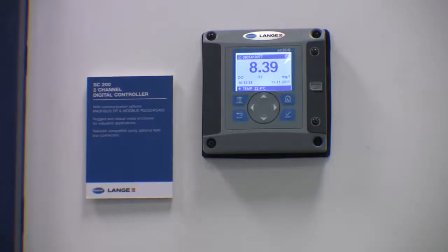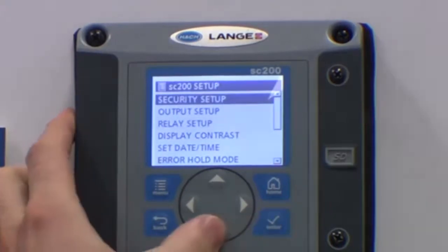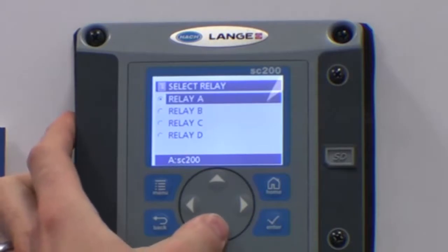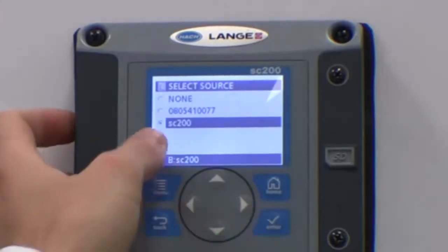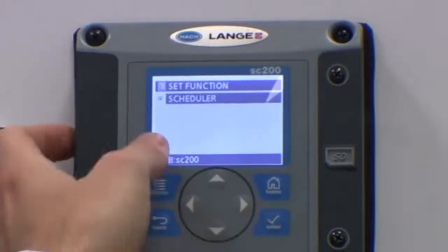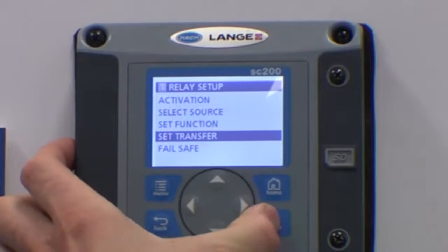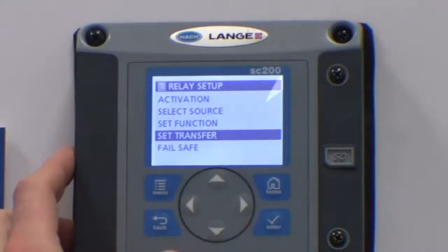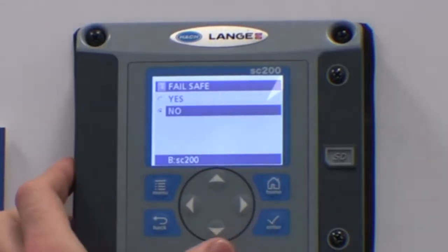Here is how to set up the cleaning cycle. Press the menu button and select SC200 setup. Now select relay setup. Select the relay that is connected to your air blast system. Firstly, select the source — this will need to be your controller. Under set function, check it is set to scheduler, which is the real-time clock. The transfer will need to be active or inactive, depending on whether you have connected to the normally open or the normally closed side of the relay. This will also need to be checked along with the fail safe.